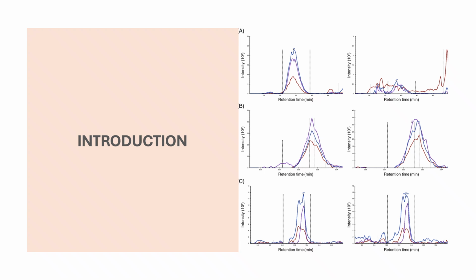False peaks can lead to serious consequences. That is, misdetections of target compounds, false identifications, incorrect quantification, and ultimately flawed analytical conclusions. Whether you're working in pharmaceutical analysis, environmental testing, or food safety, understanding how to recognize and address these issues is essential for data integrity. So let's dive into what causes these false peaks and, more importantly, how we can prevent and resolve them.